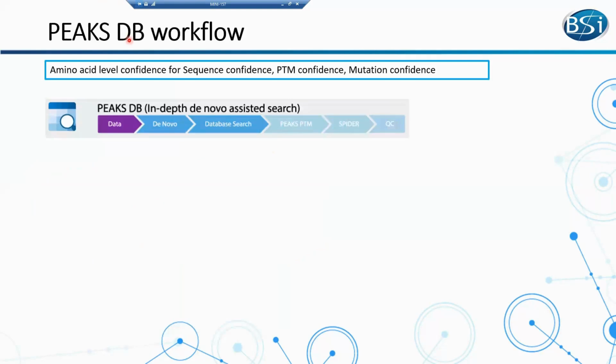Okay, then we'll introduce the new PEAKS DB workflow in PEAKS 11. For those who are familiar with PEAKS, it's basically the same. The icon is the same, and the workflow is also the same.